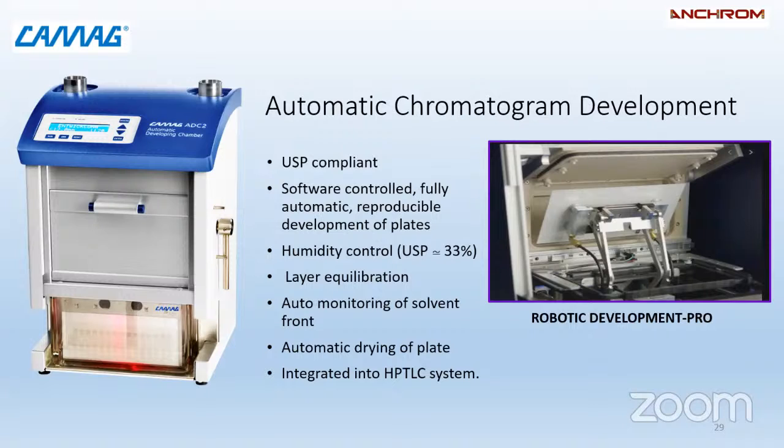And the most important factor is, as HPTLC is an open system, we may get variation in the result, although we are following the same methodology for a particular sample.